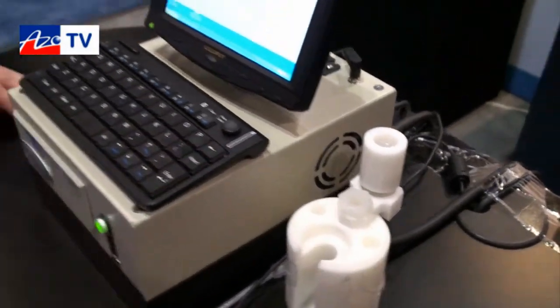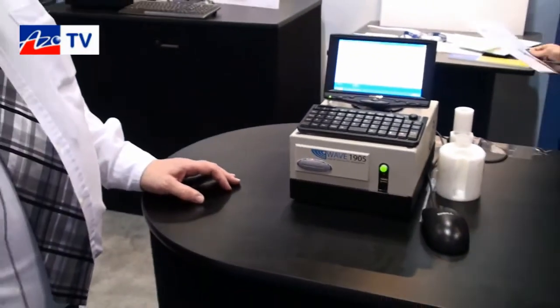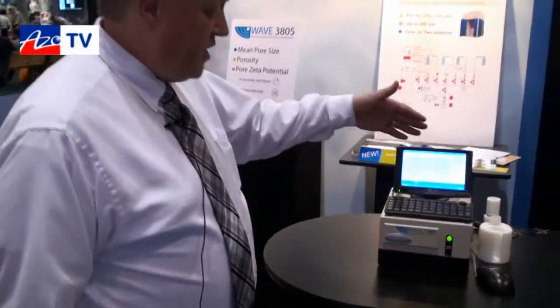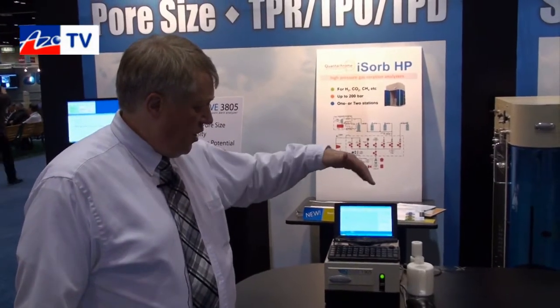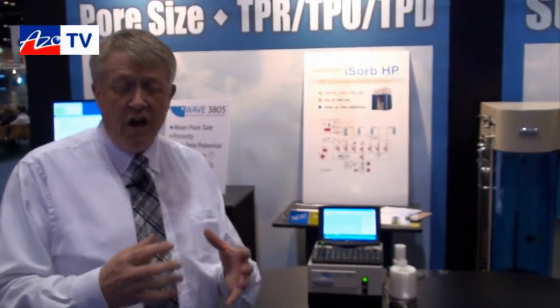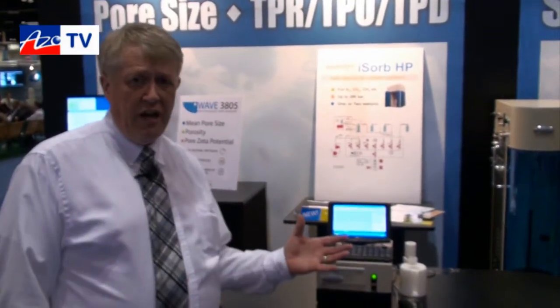The electrode setup is similar but uses a different electrode. The sample is fully wetted with a conducting electrolyte — not water or organic — and put into the cup with an electrode at the bottom. This small box imparts a very high-frequency conductivity measurement to the sample, measuring the high-frequency ionic conductivity through the sample at three megahertz. That ionic conductivity — or rather the loss of ionic conductivity in the sample — corresponds directly to a loss of porosity, giving a direct reading.